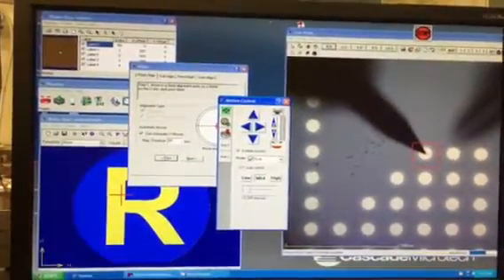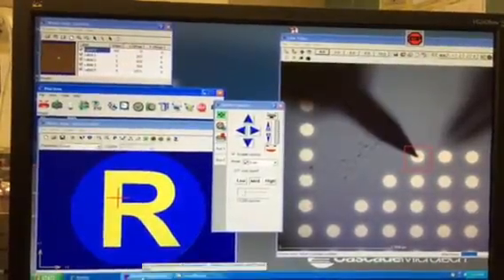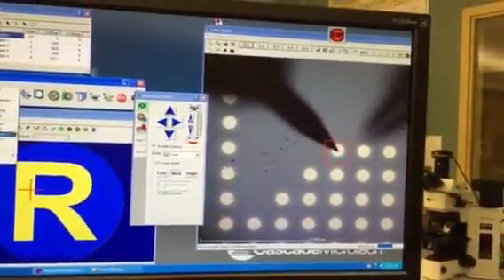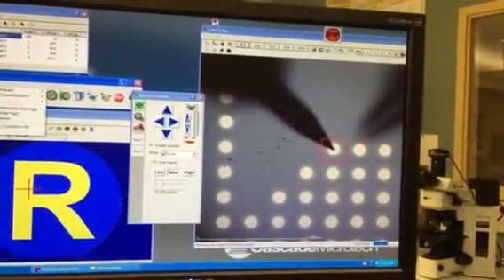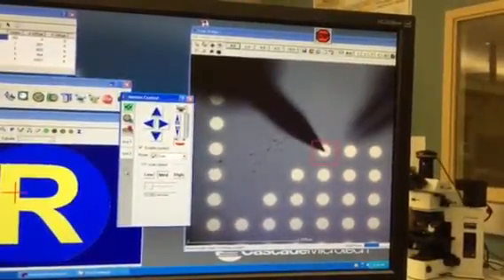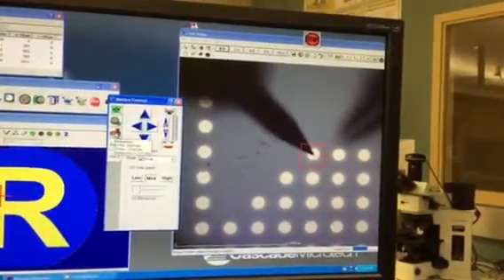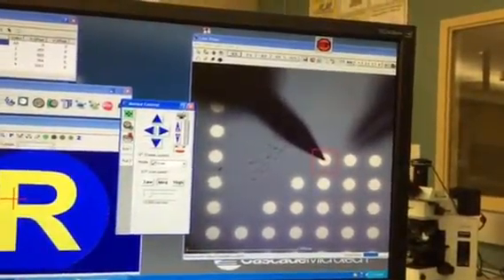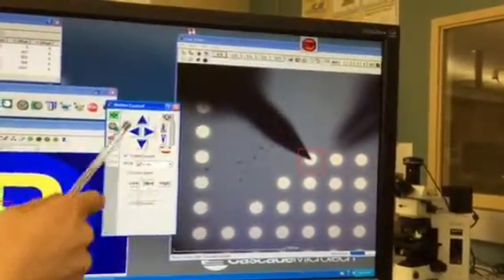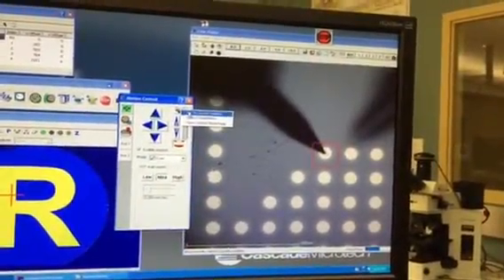That moves to reference. I want to set reference. So if you right click on this one, I thought it was right clicking here to set reference. I think that moves to reference, but I'm looking for the place to set reference. If you right click on this one, it has set to current. Oh, okay.